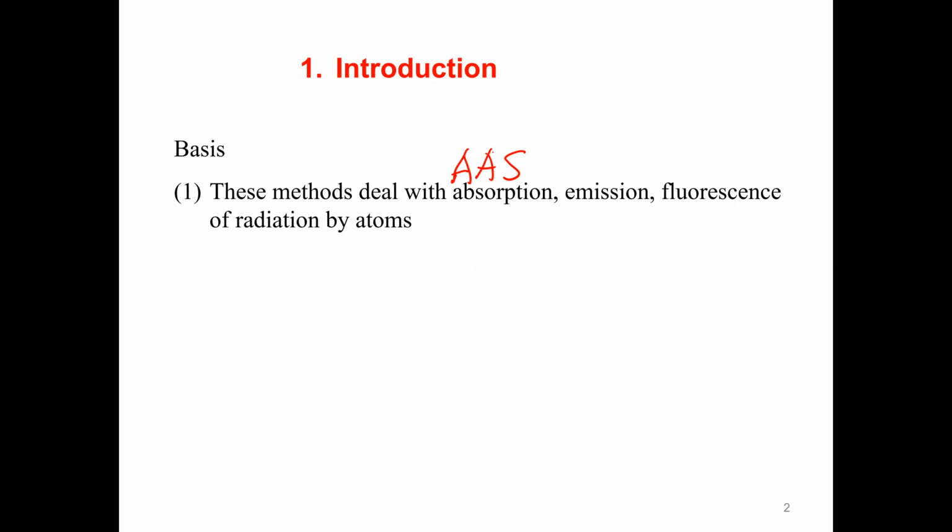If it's atomic emission spectroscopy, we use AES. E means emission, S means spectroscopy, A means atomic. If we talk about atomic fluorescence spectroscopy, we use AFS.